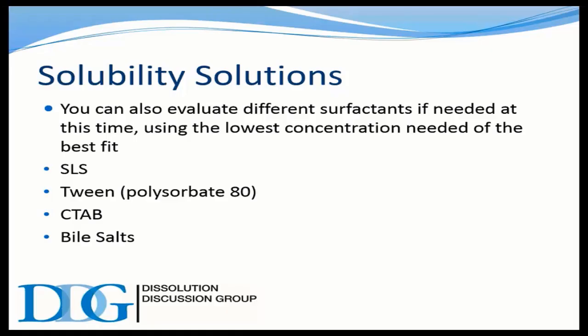Yeah. In a generic instance, there's usually an abundance of this. This is not an issue, and if you can go 500 milliliters in each flask, that's great. But just beware. Sometimes there are physical constraints, but there are monetary constraints in some of this, and just the availability of it, it's just not there.